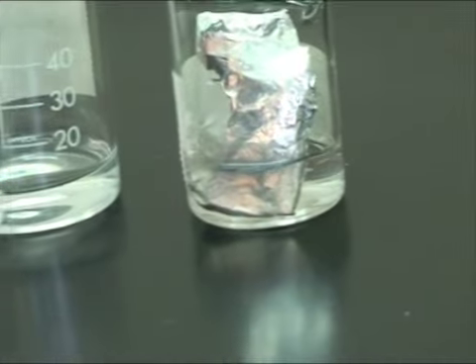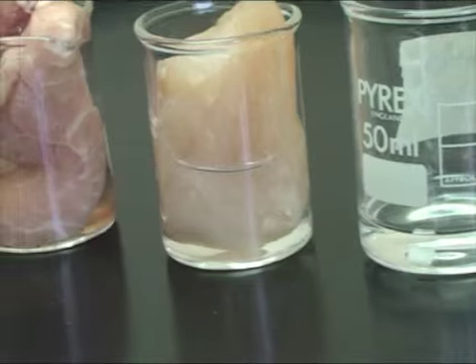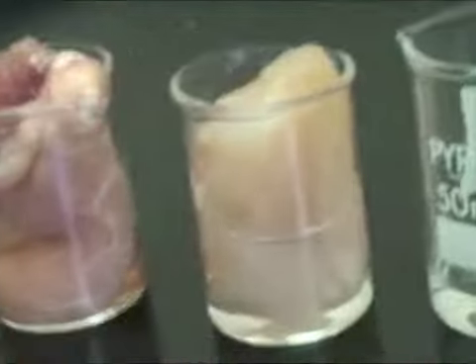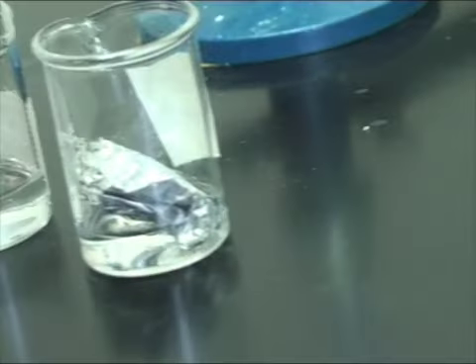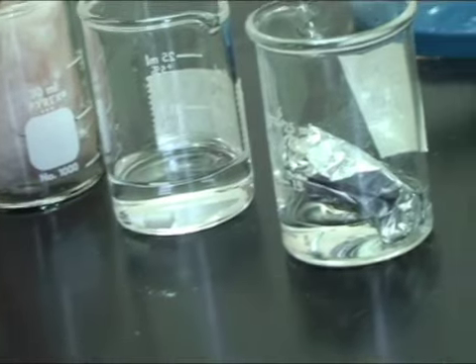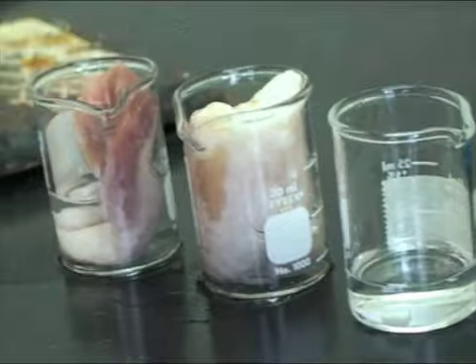After 10 minutes, there were still no changes on the water side on the aluminum, and a few more bubbles were being released in the limestone. Still no change in the pork or fish as well. On the acid side, still more bubbles coming out of the aluminum, still more bubbles coming out of the limestone, and the fish and pork were even whiter than before.